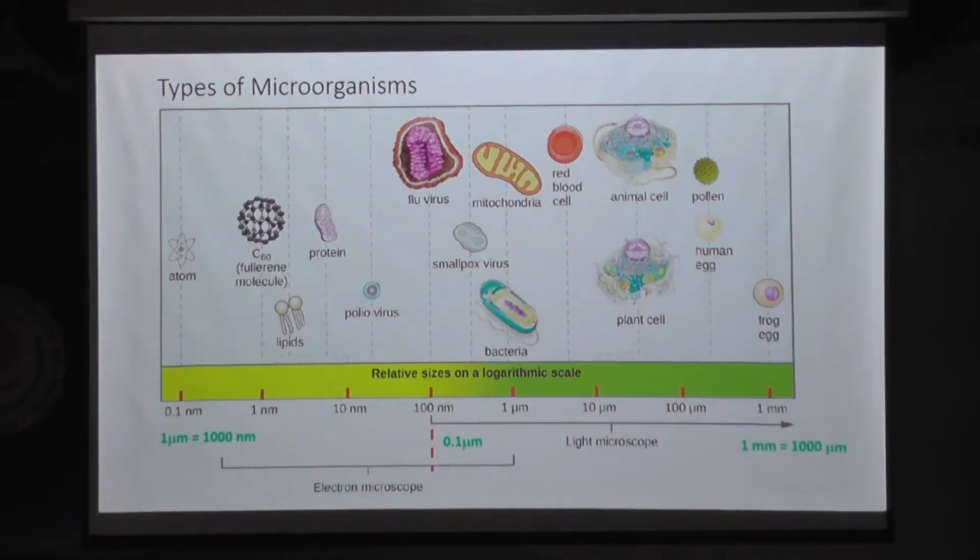In short, animal cells, RBCs, mitochondria, bacteria, these kinds of things we can visualize with the help of microscopes. Maybe the contrast type will be different in each of them. Live cells will be seen differently than histopathology cells.